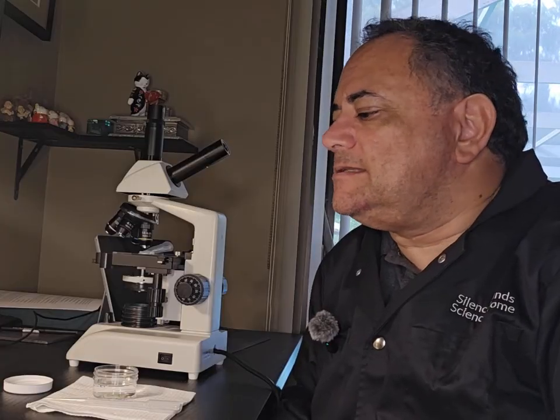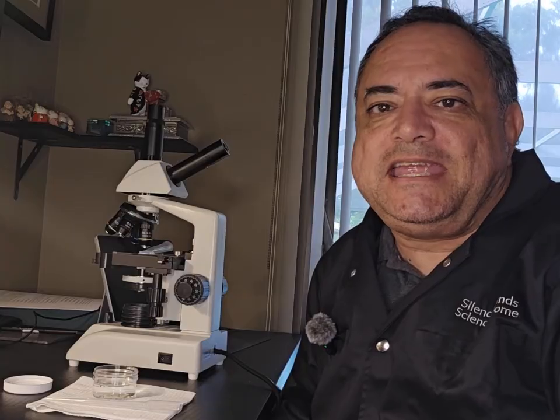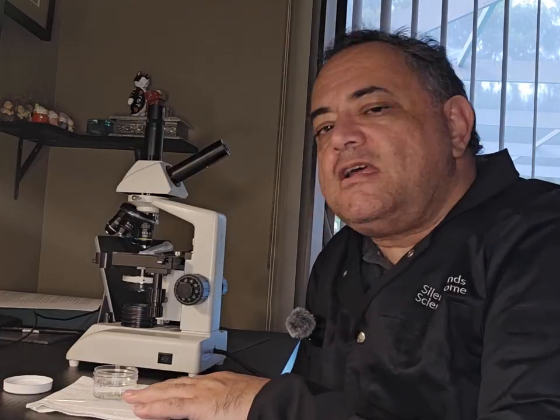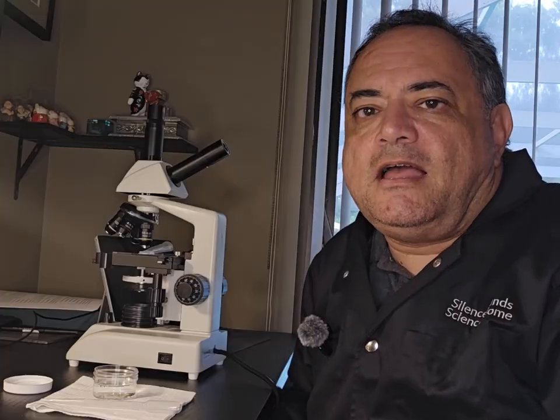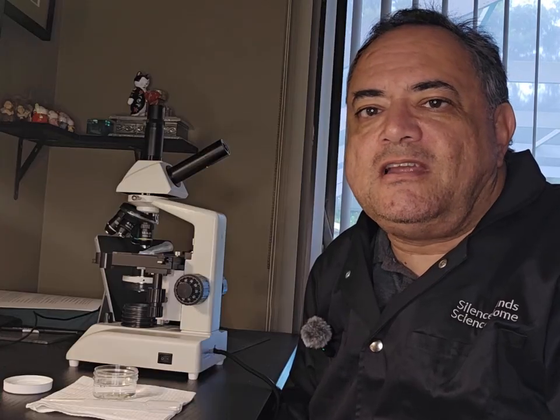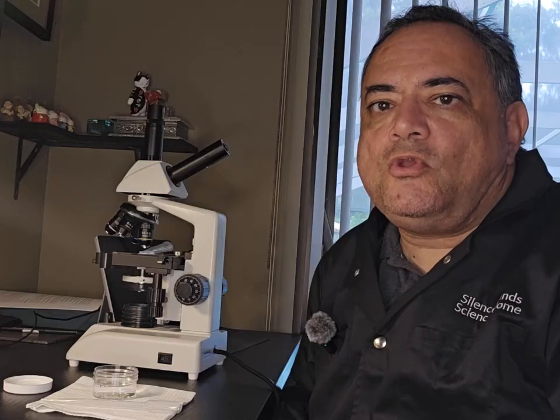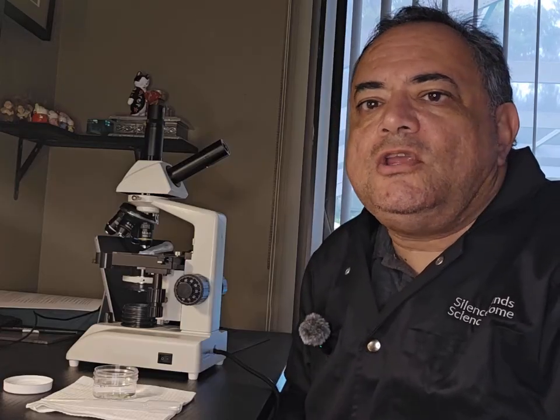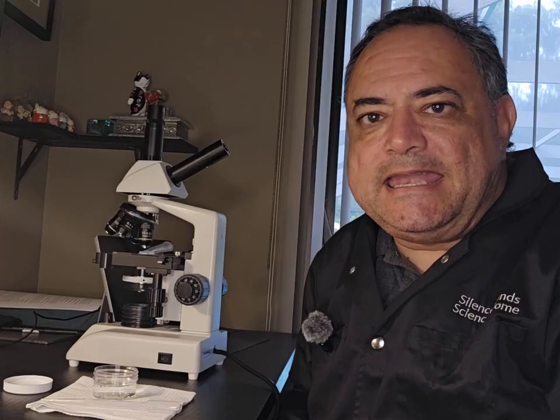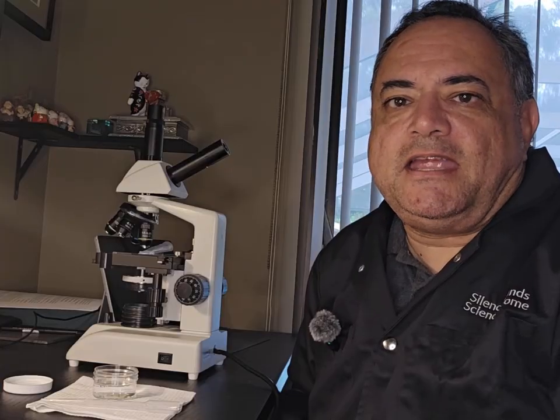And also, please bear in mind that these are whole organisms, 3D. They're translucent, a lot of them. We have a lot of baby tardigrades in my culture, so they are kind of small and translucent. So focusing and getting a whole picture of the tardigrade can be a challenge, but it's part of the fun. So when you see the video, you'll see the images, and you'll see me constantly focusing in and out to get a proper, good picture of the tardigrade.